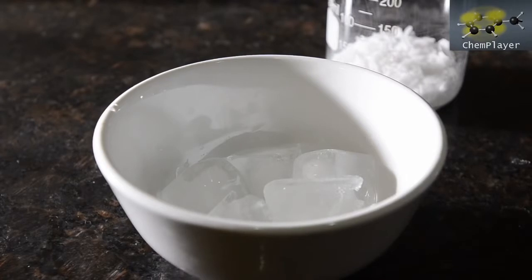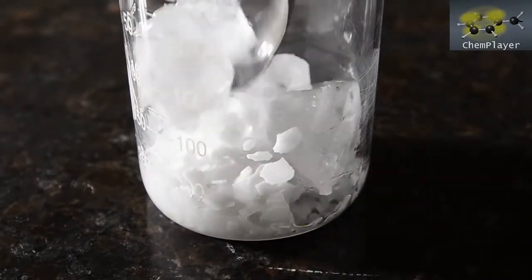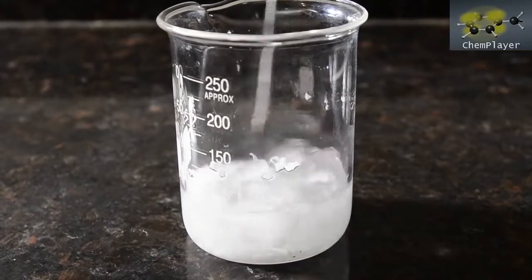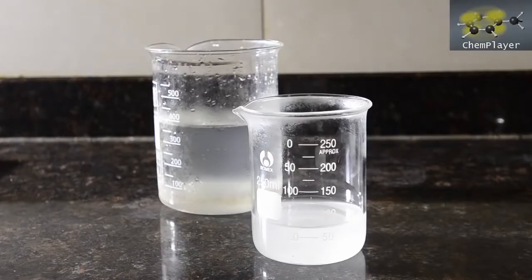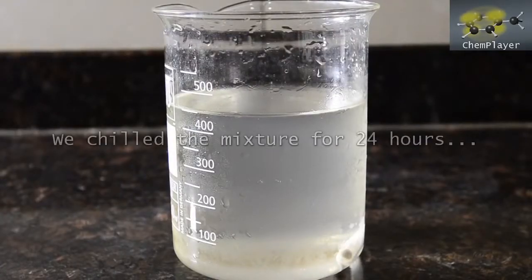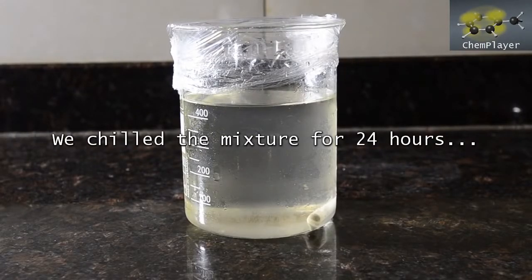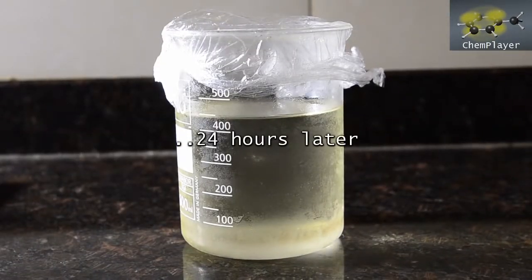We dissolved the potassium hydroxide in 50 grams of ice. And then chilled the solution. Okay, let's add this to our cool reaction mixture. And now we covered this up and chilled it down for 24 hours. This is supposedly the time required for crystallization to occur. Here's the result. Absolutely no crystals.